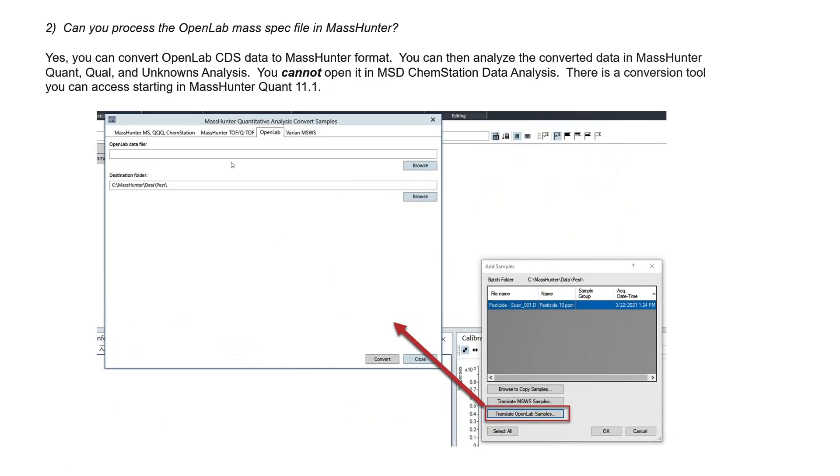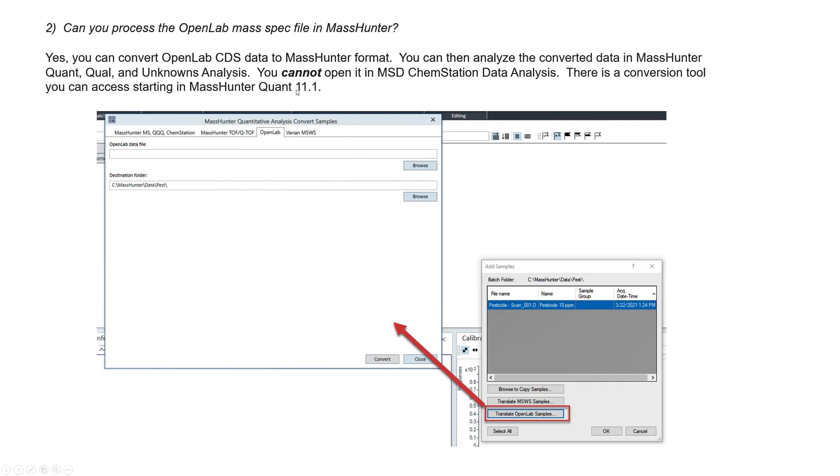So the second thing, can you process the OpenLab MassSpec file in MassHunter? Yeah, they're the same file format, so you can convert OpenLab CDS data as a MassHunter format. You can then analyze the converted data in MassHunter using QuantQual and unknowns analysis. You cannot open it in the MSD chemstation data analysis. And there is a conversion tool that you can access starting in MassHunter Quant 11.1. So you can see the plugin here, or not actually plugin, but just the software, the converter, and you translate here. I haven't tried that personally, but Emily told me about that.